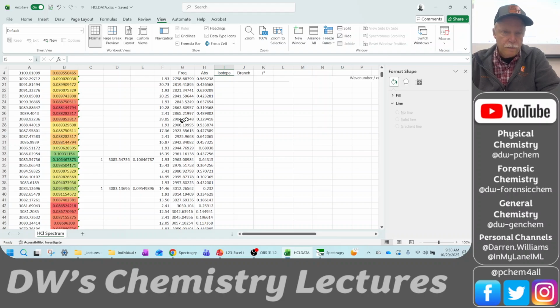And this is the isotope. This is the taller one, the 2906. And so that's going to be the 35. And the shorter one's the 37. Is everybody okay with that? 35 is the most abundant chlorine, 37. So the most abundant would be the taller of that pair. This is an R branch line. Both of these are R branch transitions, and they're both zeros. Does that make sense?